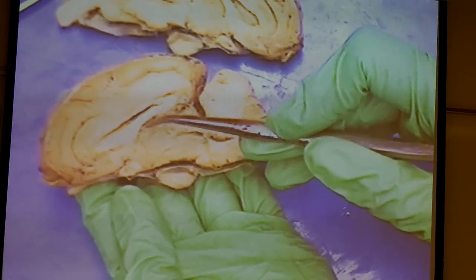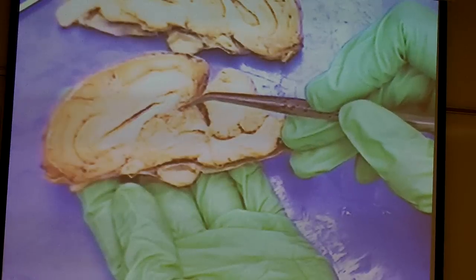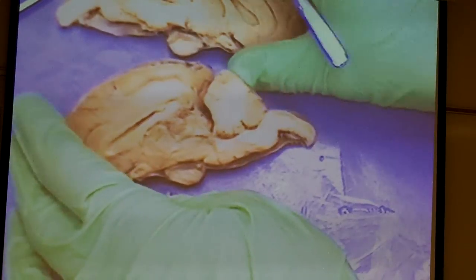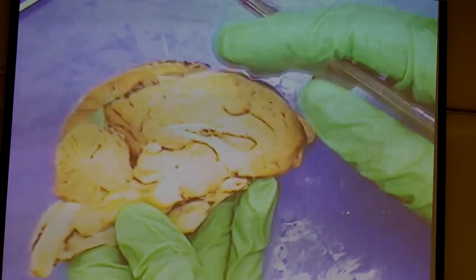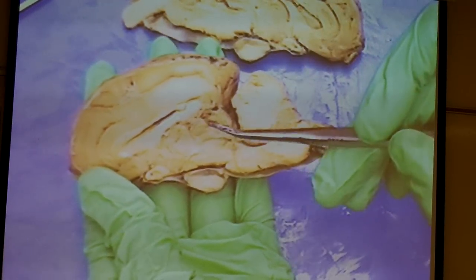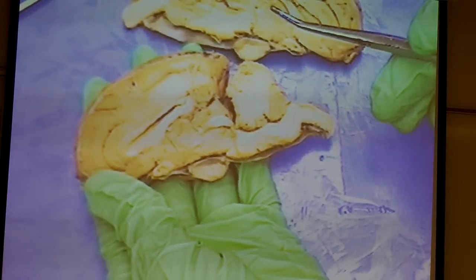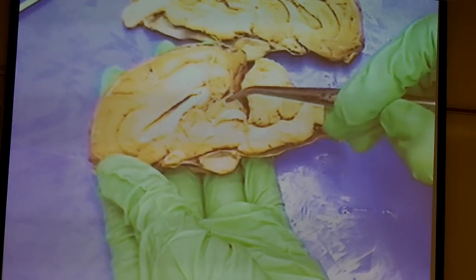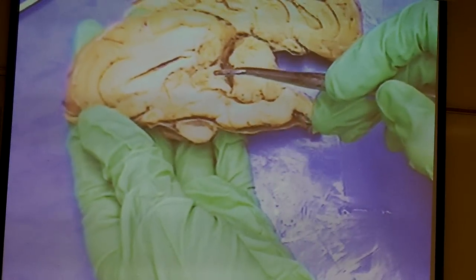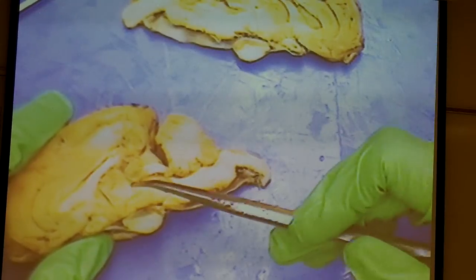Now, the epithalamus. The only structure we want you to know is this cute little finger — it looks like a nipple-like projection. Depending on how your sheep brain is cut, it may be on the other half. That's the pineal gland, and it is responsible for making melatonin.